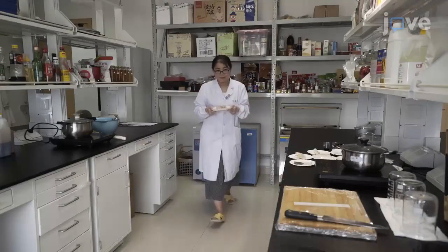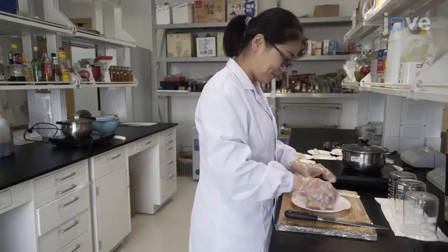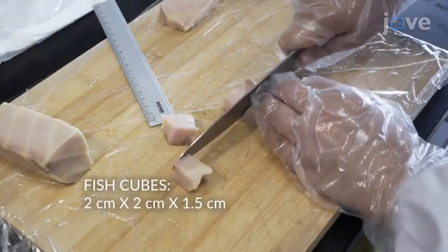To begin this procedure, thaw, clean, and skin frozen sturgeon meat as outlined in the text protocol. Cut the fish into cubes.